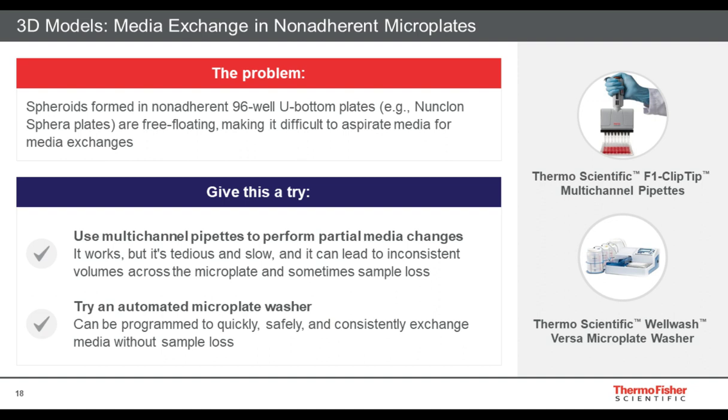One of the other things to keep in mind, and I know speaking from personal experience, when I first started working in 96-well U-bottom plates, was a little bit of an afterthought as to how I was going to change the media. And this is important because these are essentially suspension cultures. As we said, aggregates form because the internal surface of the plates are treated so that cells don't attach. And so this means if you want to aspirate your media, you're also going to aspirate your cells. And so there are several ways to sort of minimize this risk.